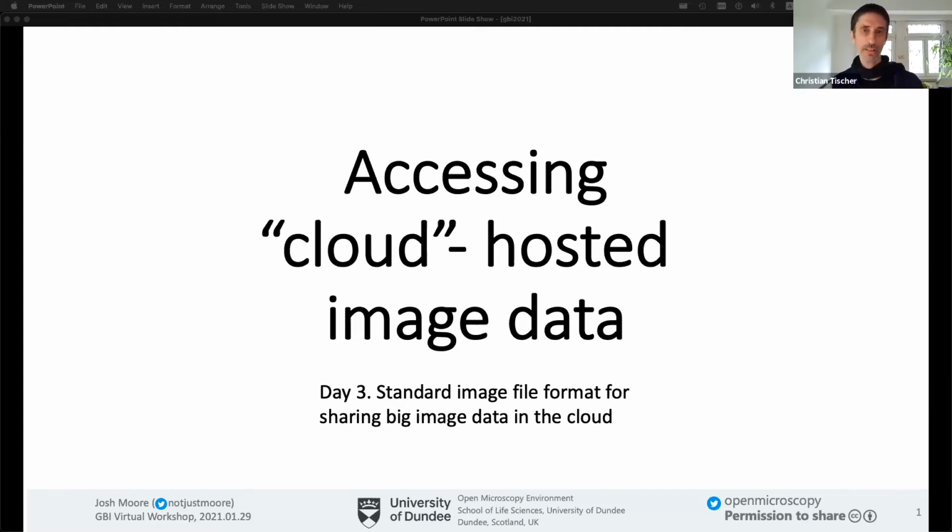Yes, very good question. Thank you. Yes, we definitely do. And I will show an example of this at the end, in the last hour. I think the main thing is you need a viewer that does the job. Because, for example, in ImageJ, whatever images you need open, they need to have exactly the same amount of pixels and the same size in 3D. And that's not good for multimodal, right? Because you have very different resolutions. Maybe something is a little bit tilted because it was acquired with a different microscope.